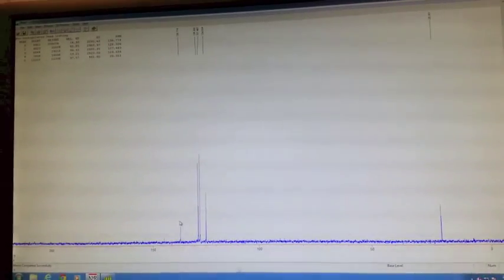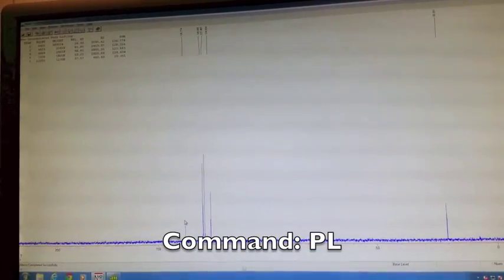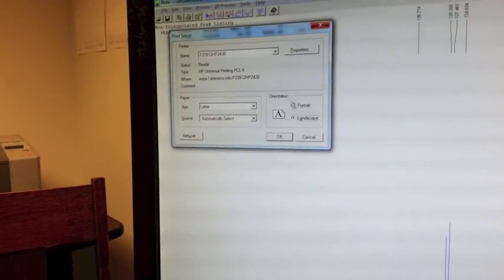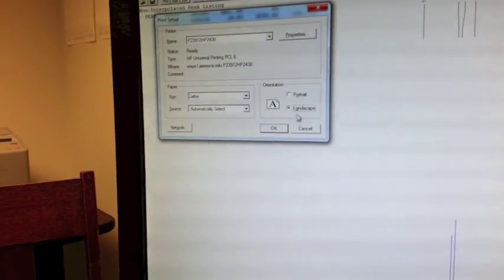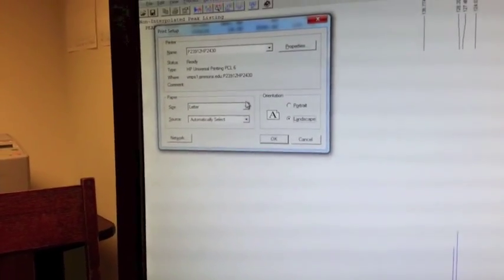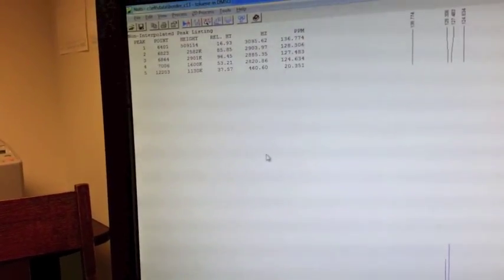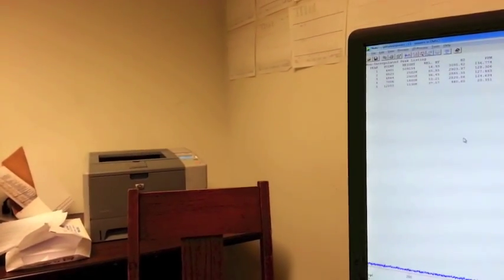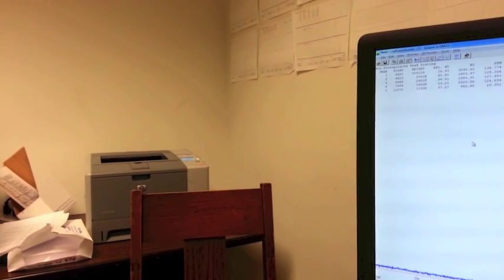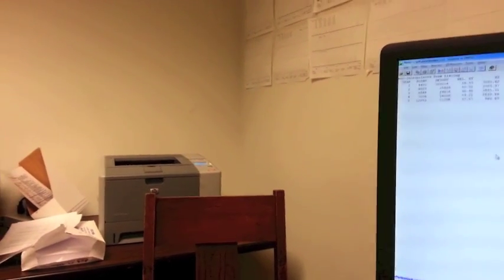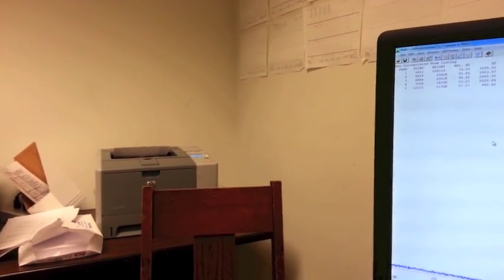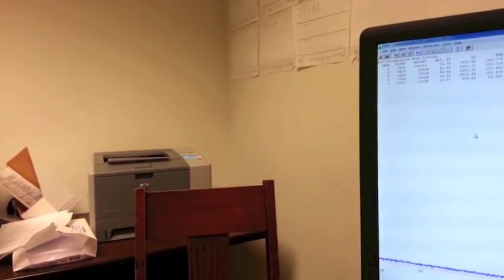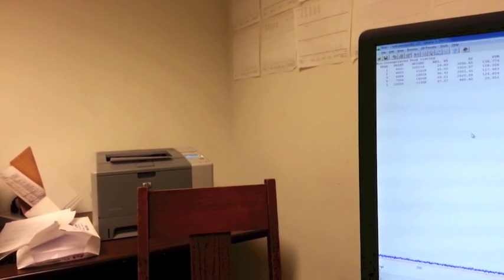You want to make sure that it's landscape if this box pops up. The printers for the NMR are located right next to the computer. And that's it. That's all you have to do.